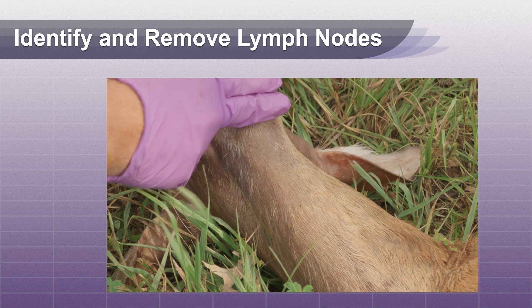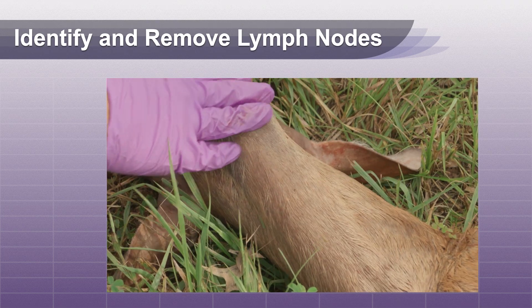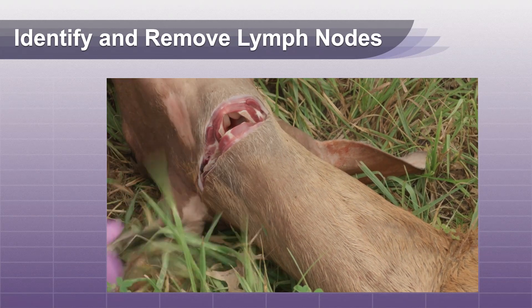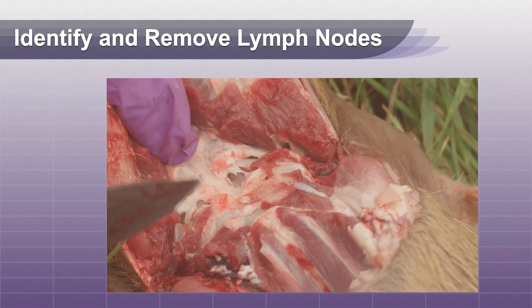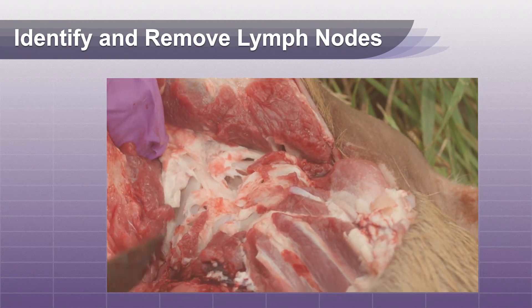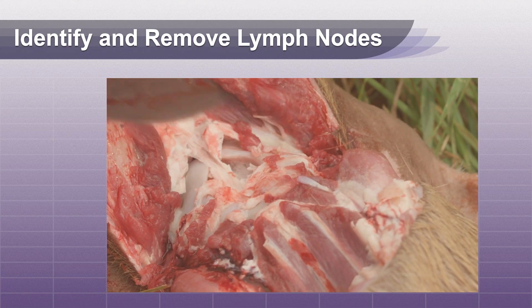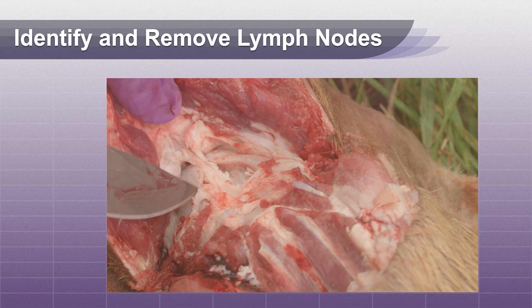The lymph nodes that we need for testing are located in the deer's throat. With the head positioned upside down, locate the Adam's Apple or trachea. Cut through the Adam's Apple all the way to the two shiny bones where the head joins the neck. The lymph nodes we want lie immediately in front of those two conspicuous bones.